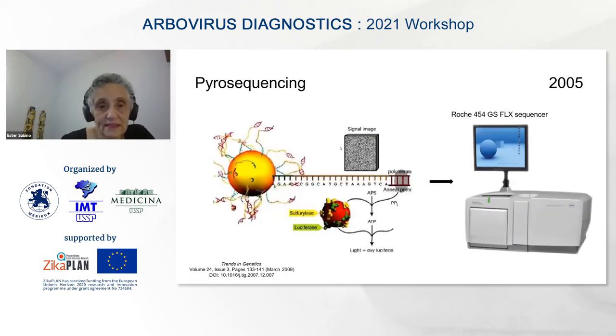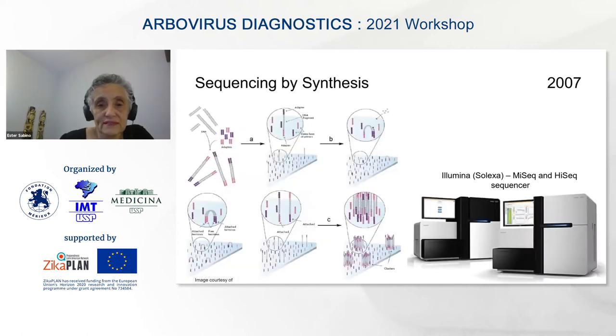This is how it goes. Each small dot will be read each time. So you have the primer, and each time it moves, it leaves one color, so you know how it's working. The machine was big, and as time went by, it was still expensive. Especially with the competition from the Illumina Solexa, the second key player in this race, the 454 was discontinued.